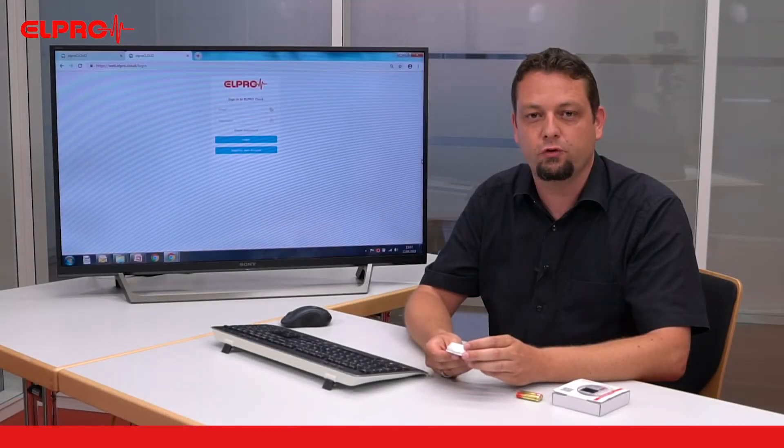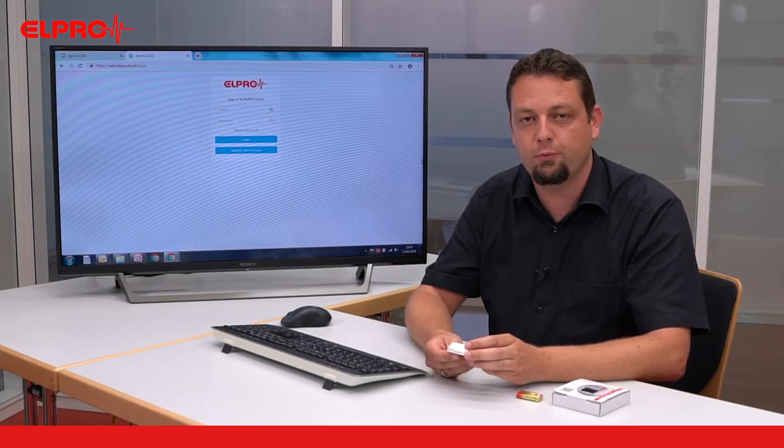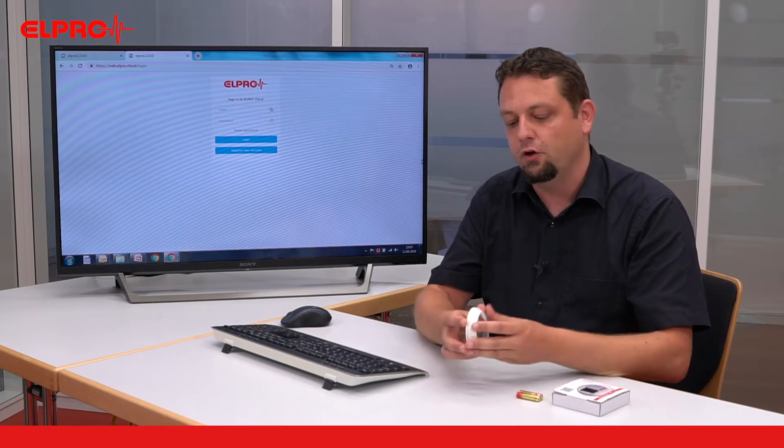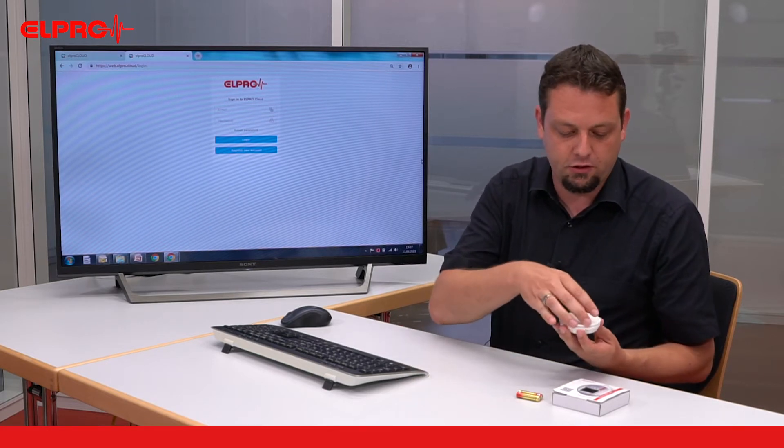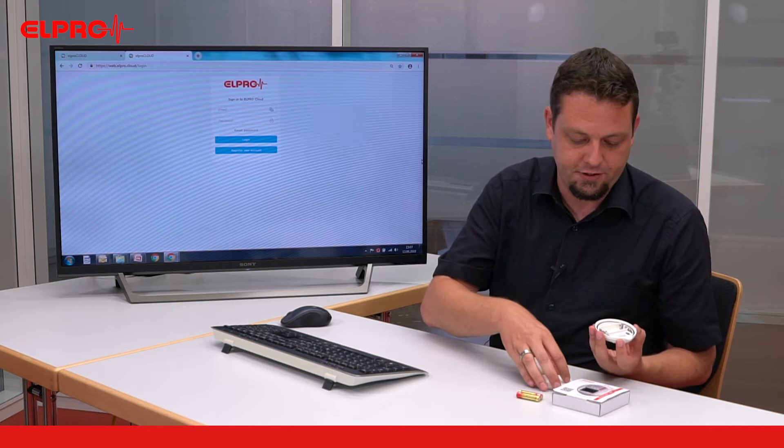We will now show how to physically connect a wireless temperature sensor Ecoloc Pro 1NTR. First of all we need to insert the batteries.